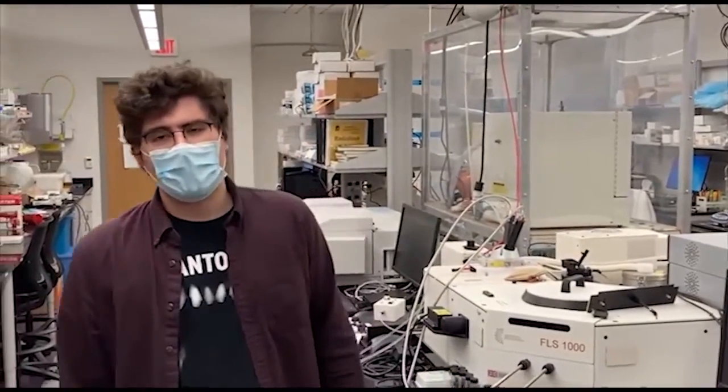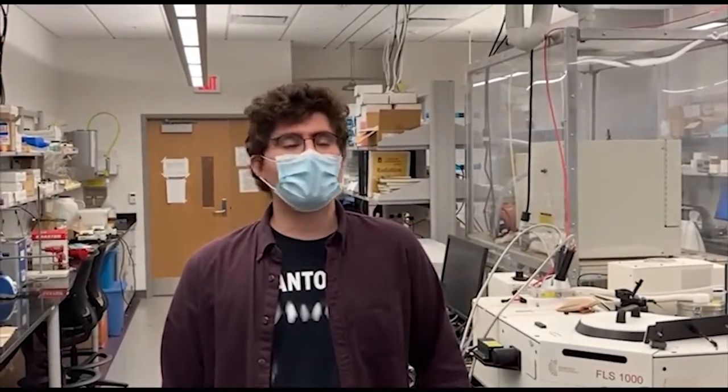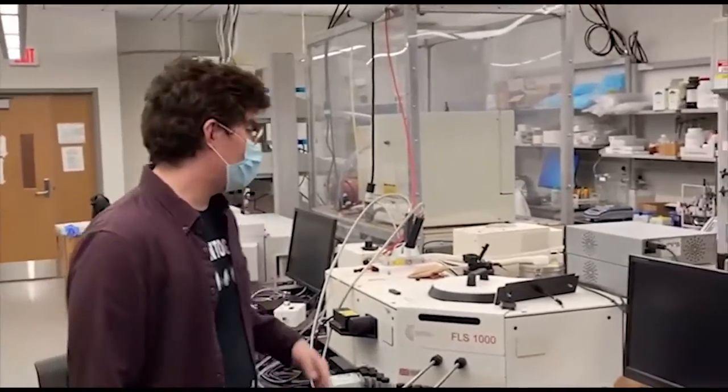Dorman's lab. In here, we do a combination of material synthesis and characterization. We have some characterizing equipment in the lab, and we do some of them inside the Shared Facility Center and the CAMD at LSU. Just giving you a quick tour of the lab.